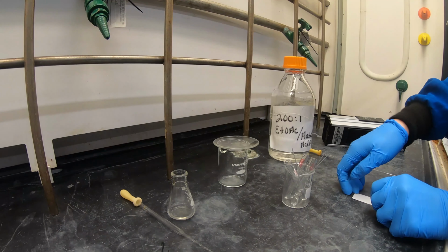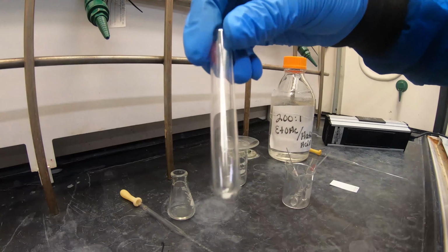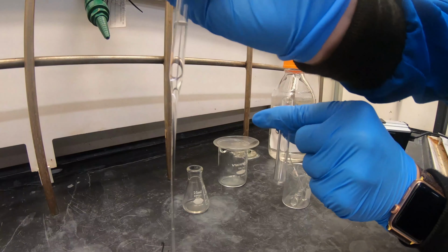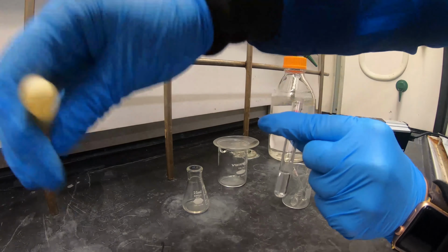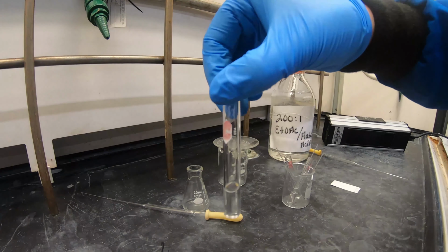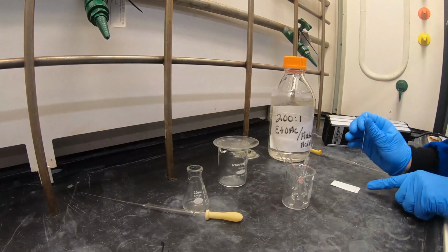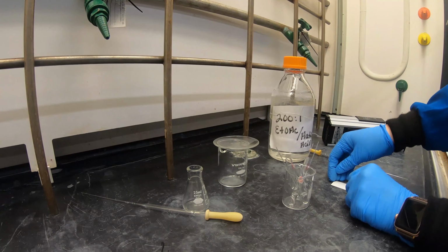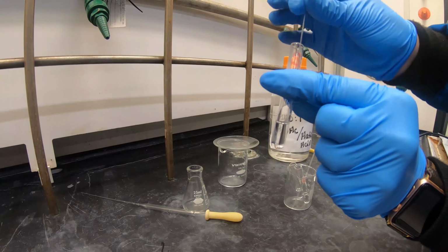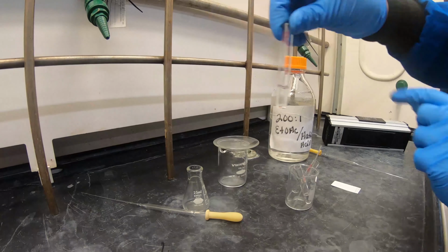Now you're going to prepare a TLC plate. Mark a baseline a few millimeters up from the bottom of the plate, and then label for 3 spots, one for your crude, one for your crystallized, and one for your standard aspirin samples. Now use a capillary tube to spot as small as possible onto the TLC plate. Using a fresh capillary, you're going to spot your next sample and repeat until all 3 are on the TLC plate.